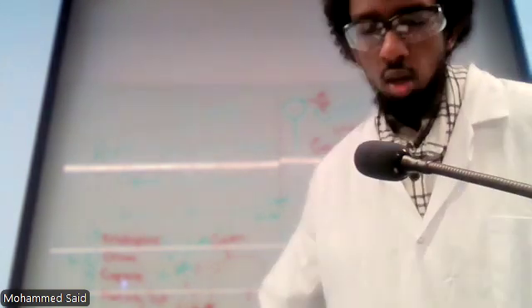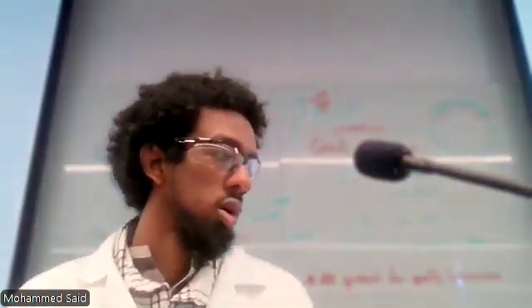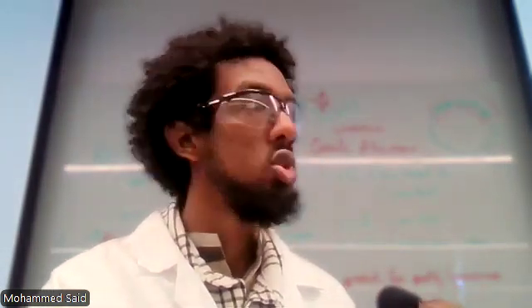Nonetheless, for exercise 5, it's actually going to be the upcoming slide, but essentially it's what you would learn from the appendix or from your lab manual, exercise 5. And then serial dilutions, I believe Dr. Brunt said that she placed them on your benches. Is that correct? Yeah. So you can also have a look. When we have time, you'll be able to record your observations.